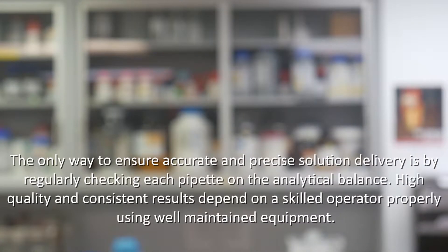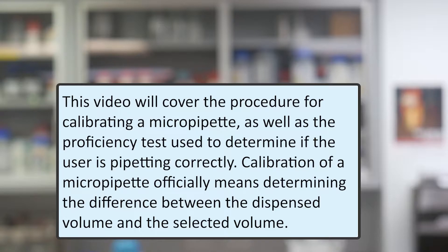The only way to ensure accurate and precise solution delivery is by regularly checking each pipette on the analytical balance. High quality and consistent results depend on a skilled operator properly using well-maintained equipment. This video will cover the procedure for calibrating a micropipette, as well as the proficiency tests used to determine if the user is pipetting correctly.